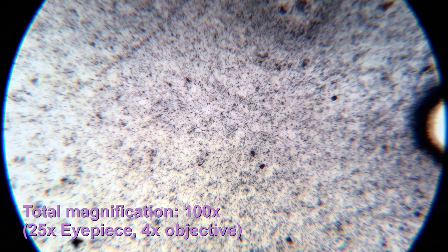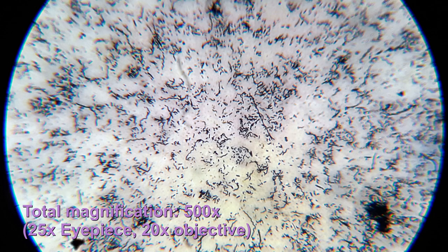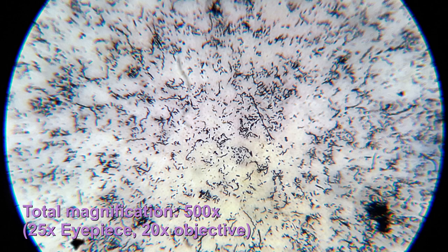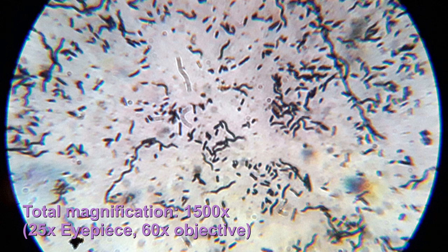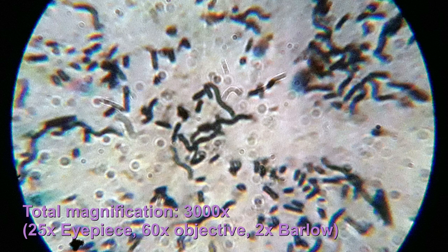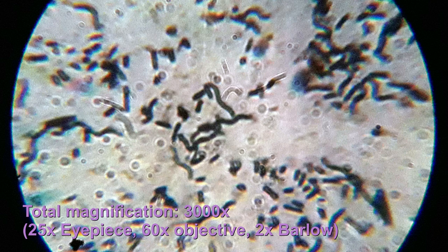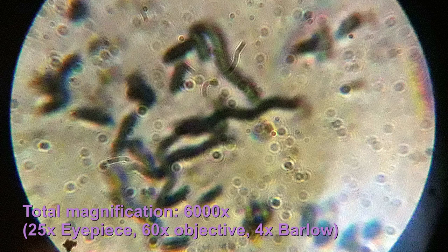These are bacteria here at very low magnification, scattered around and very small. Now we go up again. This specimen is a commercial specimen of bacteria and they are highly stained so the contrast is extremely high and therefore they can be seen quite well. Here we are already at 1,500 times - you can see these are rod-shaped bacteria, quite long. Now we're at 3,000 times. Again we have those little dots - dust and dirt on the optics. Here we are at 6,000 times. Now we can see the bacteria quite large already.